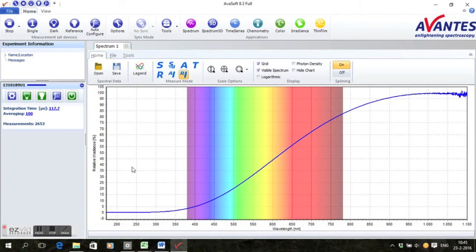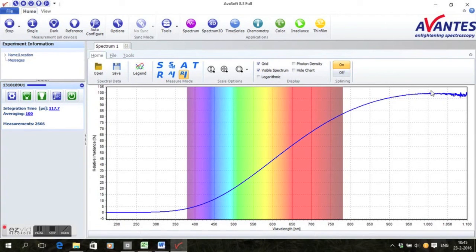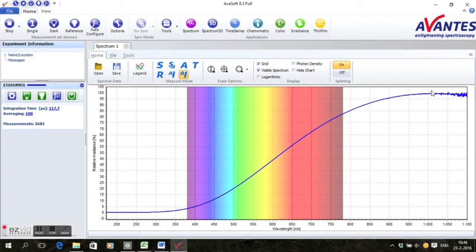Different to the other modes, this does not set the line to a straight 100% or 0% line, but sets your data to a typical halogen curve belonging to this light source.